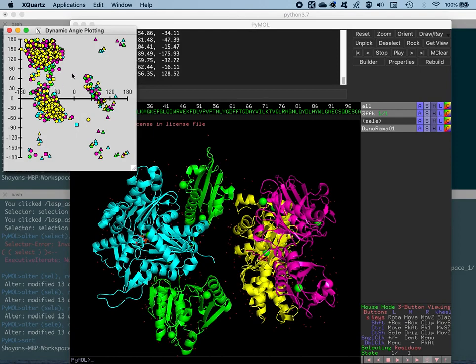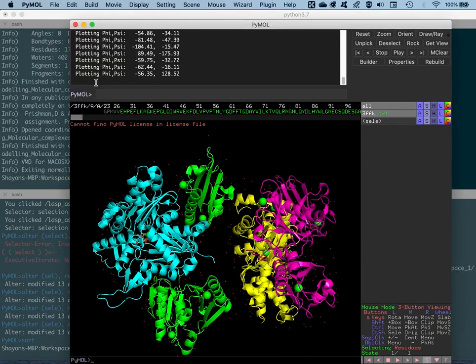So another thing that we can do, and this will be very handy, is coloring it according to the secondary structures, so that it's easier for you guys to recognize based on the residue types as well as the corresponding secondary structure that it occupies. And this is kind of a cross-check with what we already did before when we didn't color it at all and had a monochrome, a single color that's green. And we basically went ahead and right-clicked on different residues to get their particular positions by bringing them into focus. So we'll close this for the moment and go for a different coloring method.